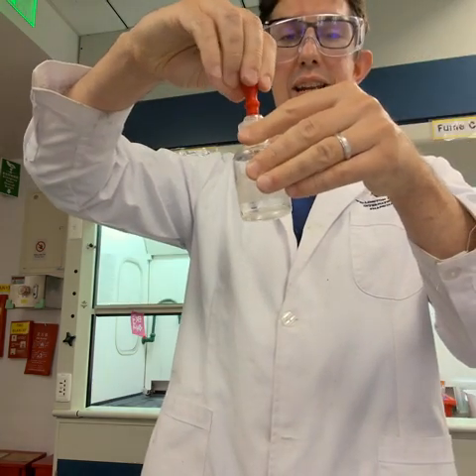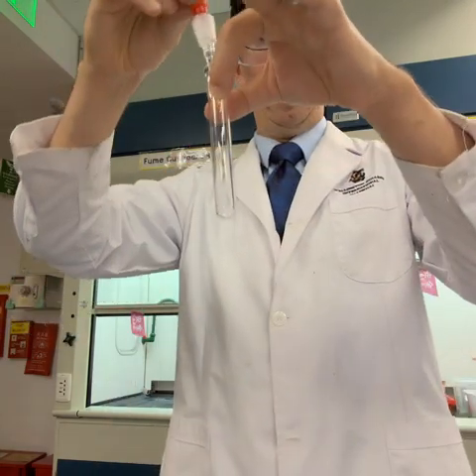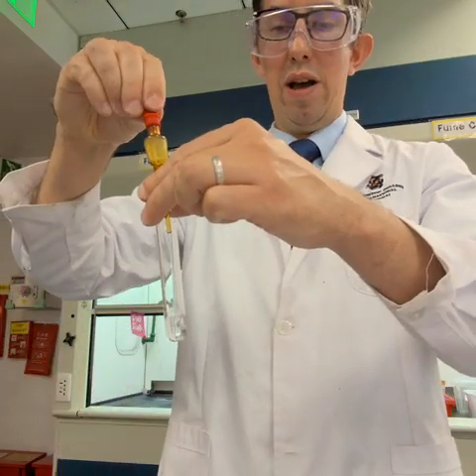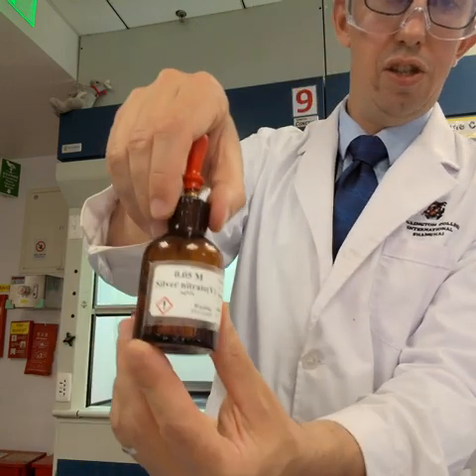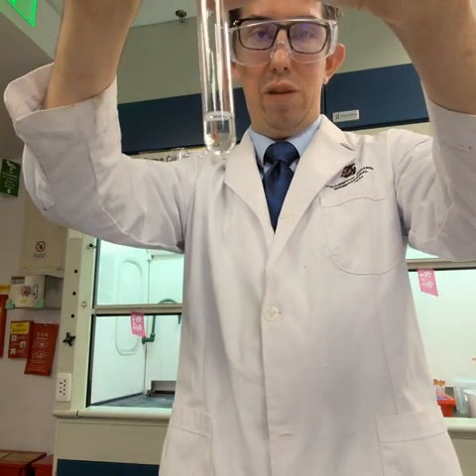We're now going to test another one. So this one here is another halide. Again, it could be iodide or bromide. So we're going to add a bit to the test tube. We're going to add a few drops of the next test reagent, nitric acid, to remove some of the carbonate ions. And then we're going to add the second test reagent, silver nitrate. And we should get a precipitate.